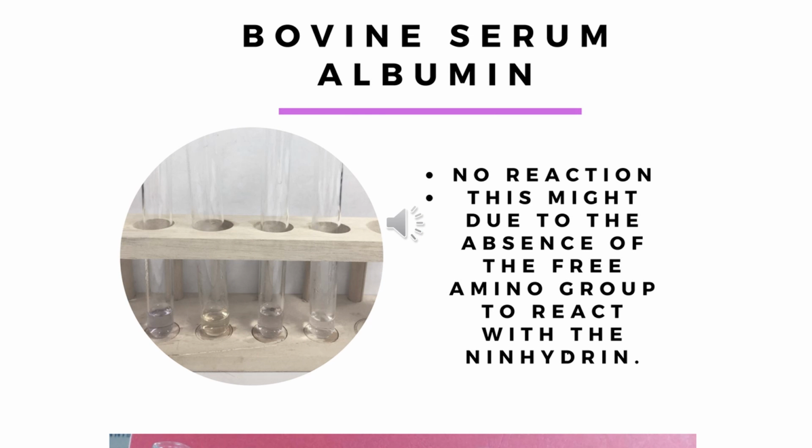For bovine serum albumin, it gives rise to a negative result. There is no reaction of BSA with Ninhydrin. This might be due to the absence of a free amino group to react with the Ninhydrin.